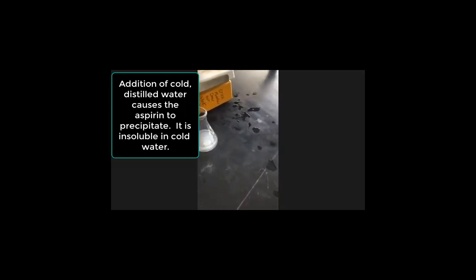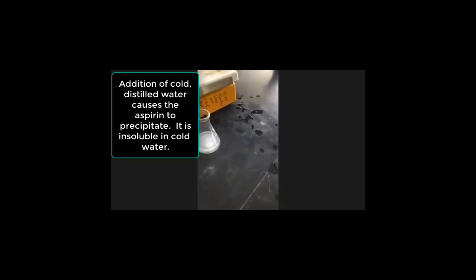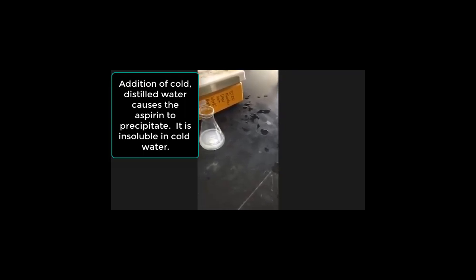So what we're going to do is force the aspirin out of the solution by adding water and then cooling it down on an ice bath. The colder the solution gets, the more insoluble the aspirin becomes. So we added 40 mils of water. And now we're going to put that on an ice bath and watch it crystallize. It's weird.